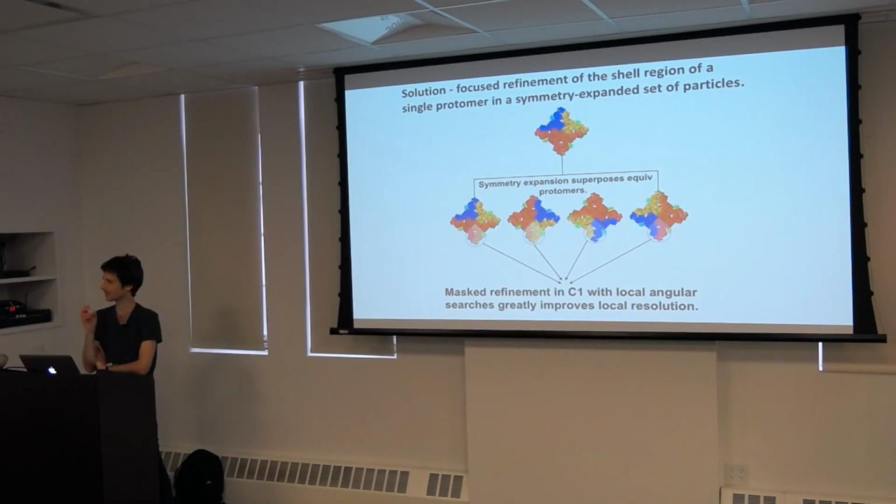I mean, the thing is, most of the high resolution data that's incorporated there is really, really high resolution data, basically atomic resolution crystal structures. Which, I mean, I don't know. Things are moving pretty fast. I don't think we're quite going to get there anytime soon, but I'll probably be proved wrong in the next couple of years. But even the best data that's out there for EM is just breaking 2 angstroms. Well, from diffraction that's not true, but from single particle at least.